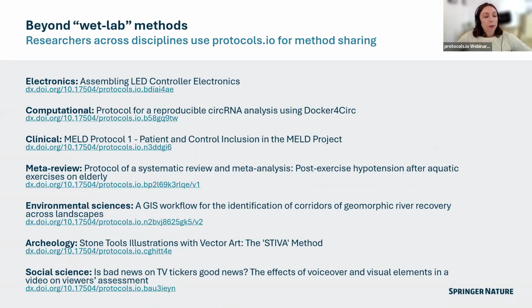So finally, I think the protocol example that I showed today was more of a wet lab biology protocol, but we are not discipline specific. So we allow any protocol or method to be put on the platform across all disciplines. These are some examples of different disciplines that have put their methods on the platform. When you receive these slides later, you can check them out if you are in any of these disciplines, but the platform is really flexible and open to everyone.